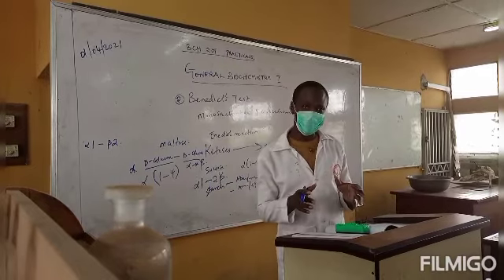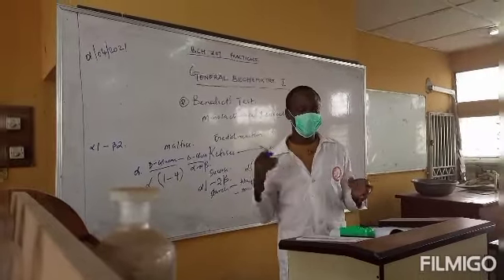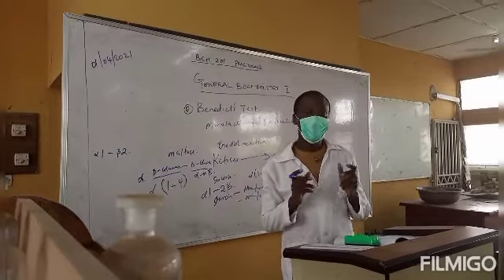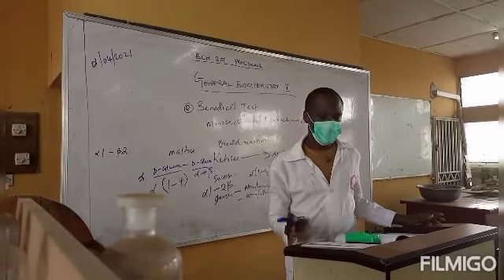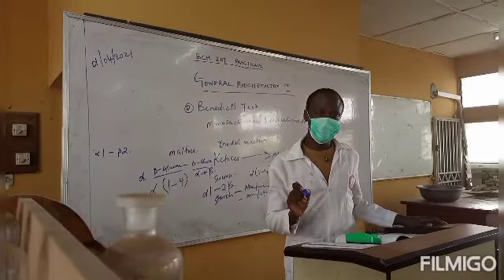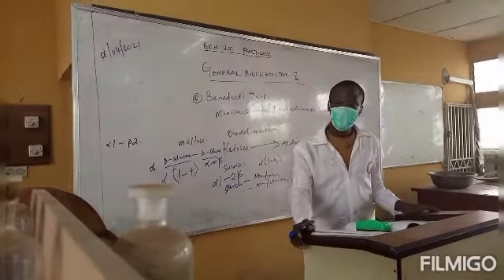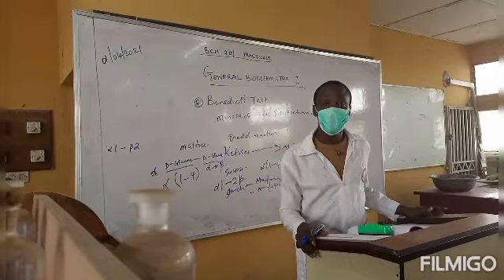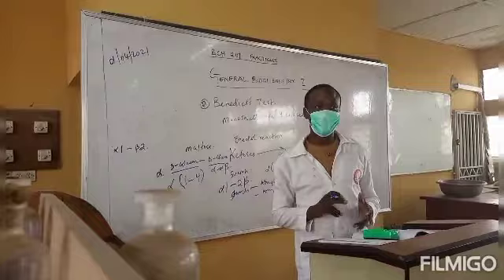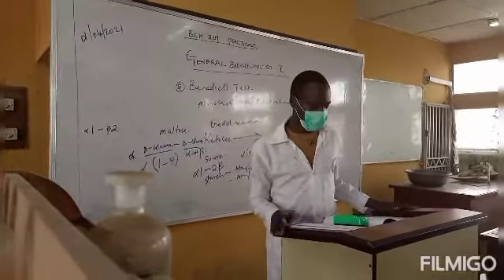After hydrolysis, we will carry out the Benedict test, which we already explained in detail, so that we will confirm that the hydrolysis is successful. It will also lead to a color change, which will help us identify the presence of carbohydrates. So these are all the tests we are going to carry out: the Molisch test, the Benedict test, and also the test for sucrose.